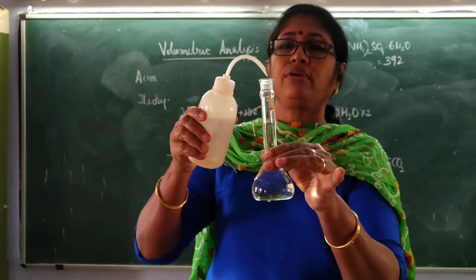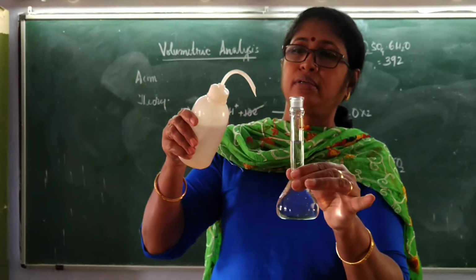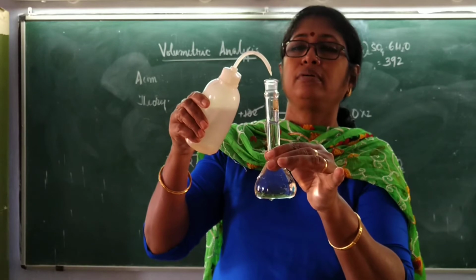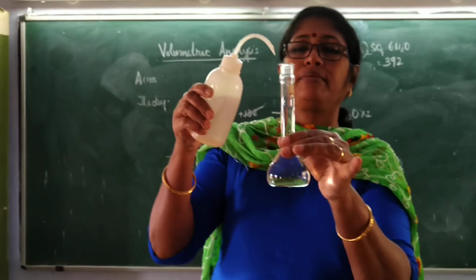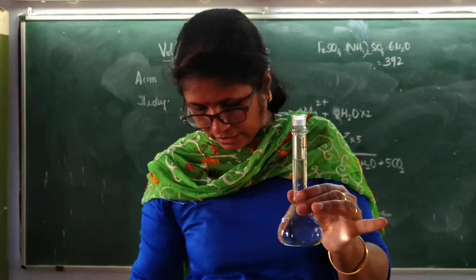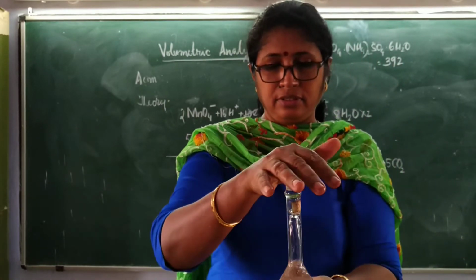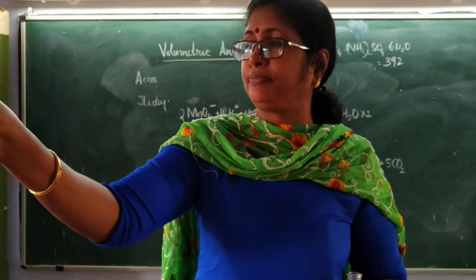Now you will have to add very carefully. One drop is enough. Okay, so this is the oxalic acid solution. Now you close it. Then you will have to shake it very well.